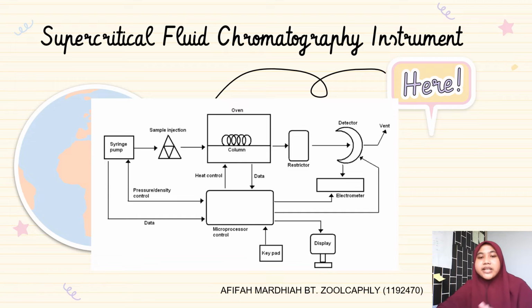SFC has similar stationary phases and similar column types as HPLC. However, there are some differences. Temperature is critical for SFC, so there should be a heat control tool in the system similar to that of GC. Also, there should be a pressure control mechanism, a restrictor, because pressure is another essential parameter in order for SFC materials to be kept at the required level.